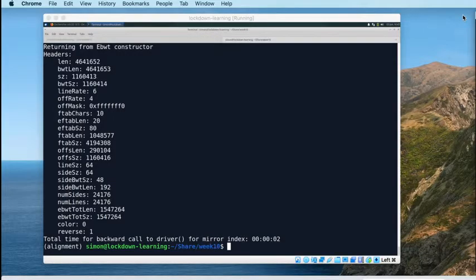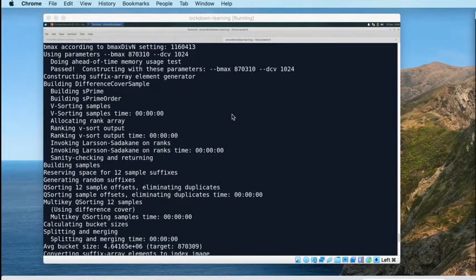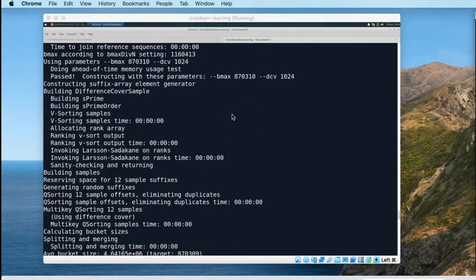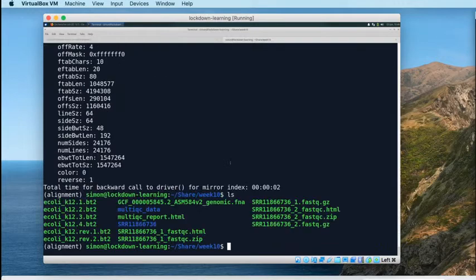Okay, so that explanation obviously took a lot longer than Bowtie2 build took to run. But let's have a look at what Bowtie2 build did. It ran very quickly. It produced an awful lot of output, which is really quite incomprehensible, this kind of log output. But more importantly for our purposes here, it's produced a few files. It's actually produced 6 files here on our hard drive.